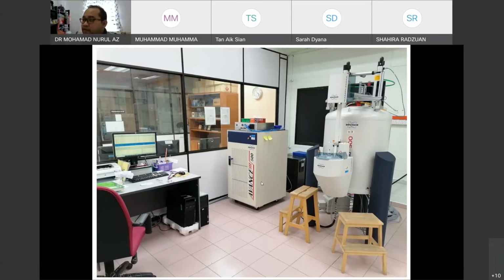Okay, if you see the color in the light here, can you see the arrow? Anybody can text me in the chat box perhaps. Cannot see, doctor. Yes, okay, can see.